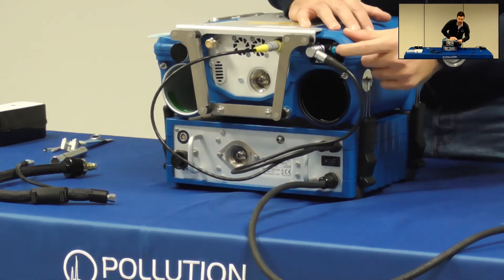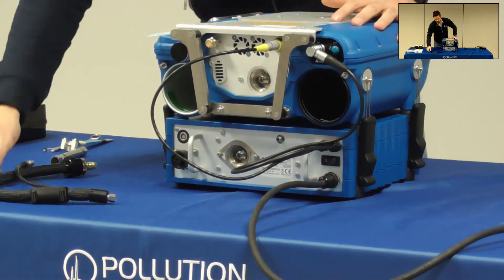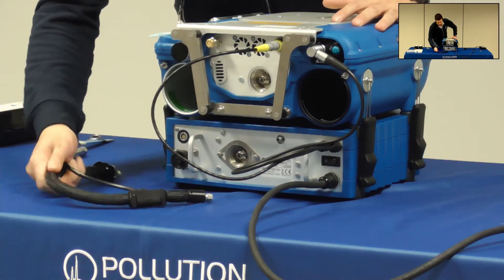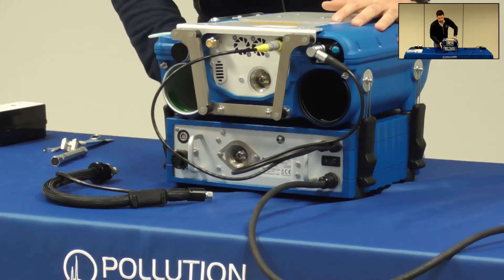And finally you have the heated transfer line. This heated transfer line will allow the gas to flow from the docking station to the Polaris.